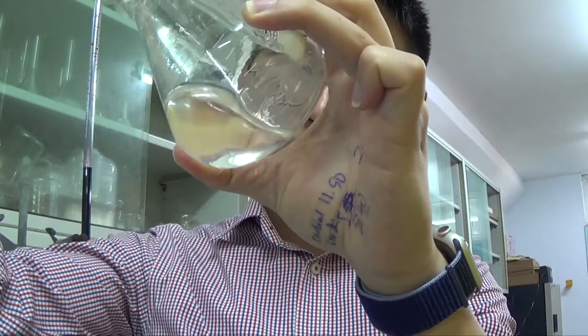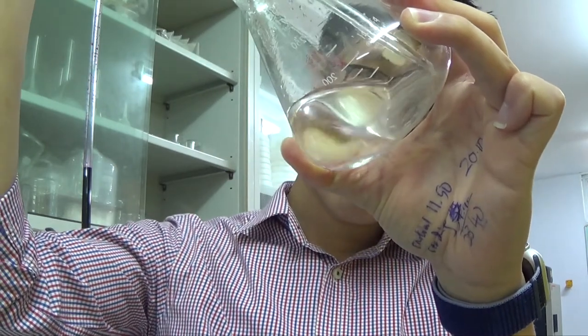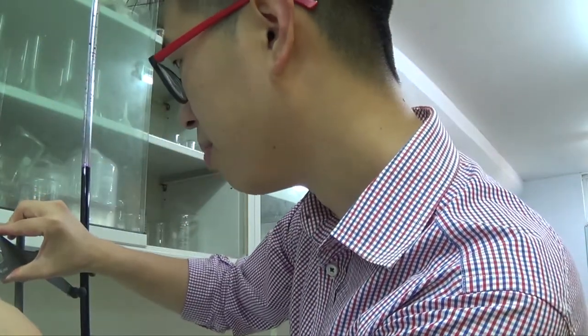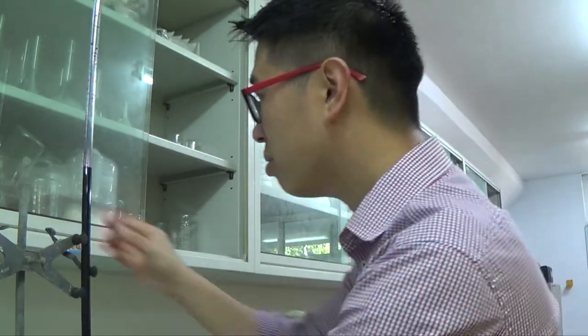So tap, tap, tap, tap, tap. There might be a little bit left, but you know, you're never going to get the very last bit out. That's okay. Don't tap too hard. You do not want to break glassware. Not in school, not in the real thing.